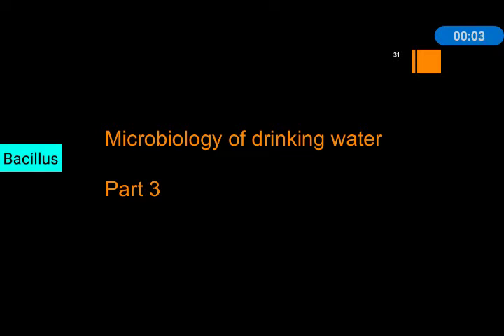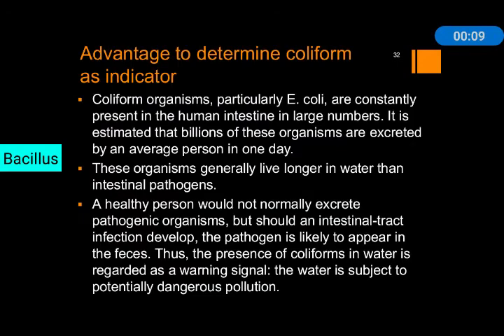Hello friends. Today we will discuss the microbiology of drinking water, part 3. Today we will discuss coliforms as an indicator and how to determine coliforms in drinking water, and its process.